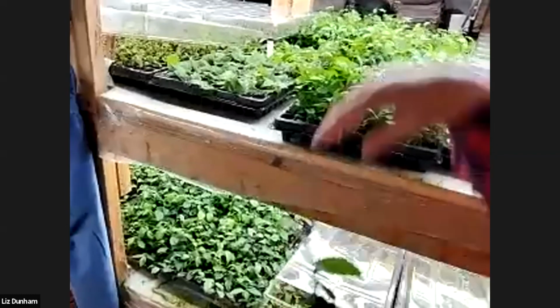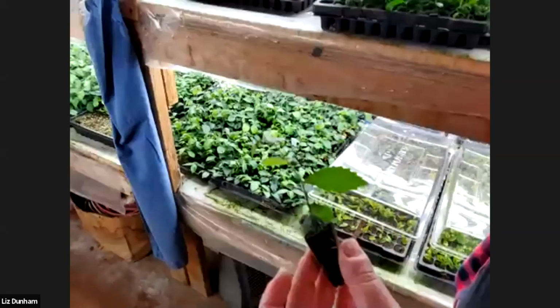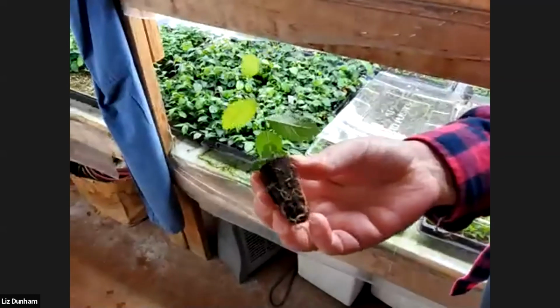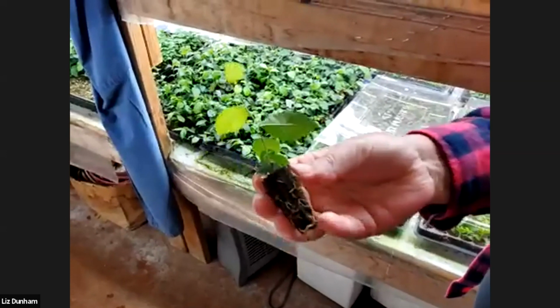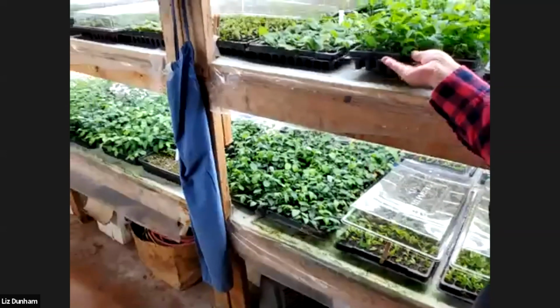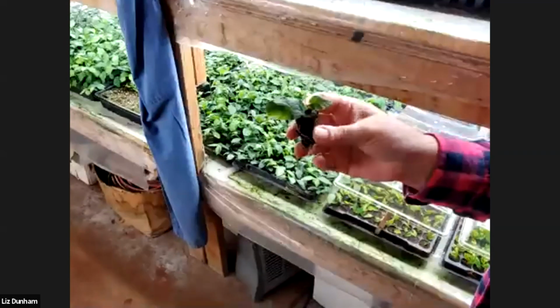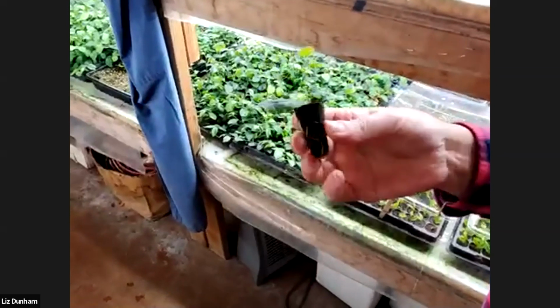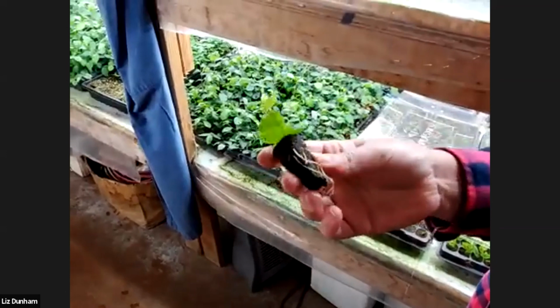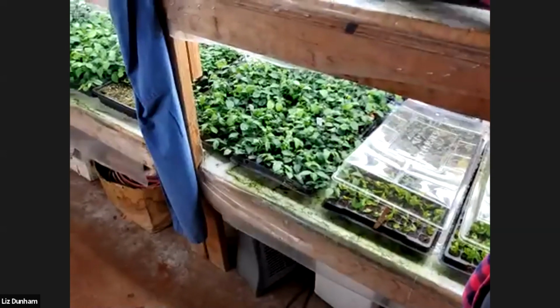So this is Almus Frontier. And these were planted. These are getting really big. These are actually planted in June from tissue culture. So these are going to go out to Canada on Monday. And here we're doing Tom Molnar's hazelnuts from Rutgers. So this is one of his new Avalon hazelnuts that is Eastern filbert blight resistant. And they're going to go to Pineland Nursery in New Jersey, aka Foggy Bottom.